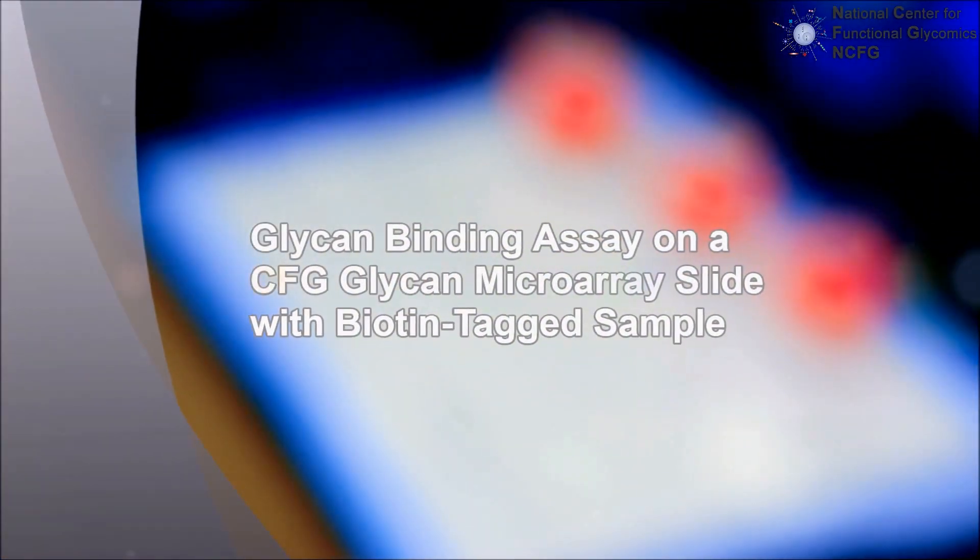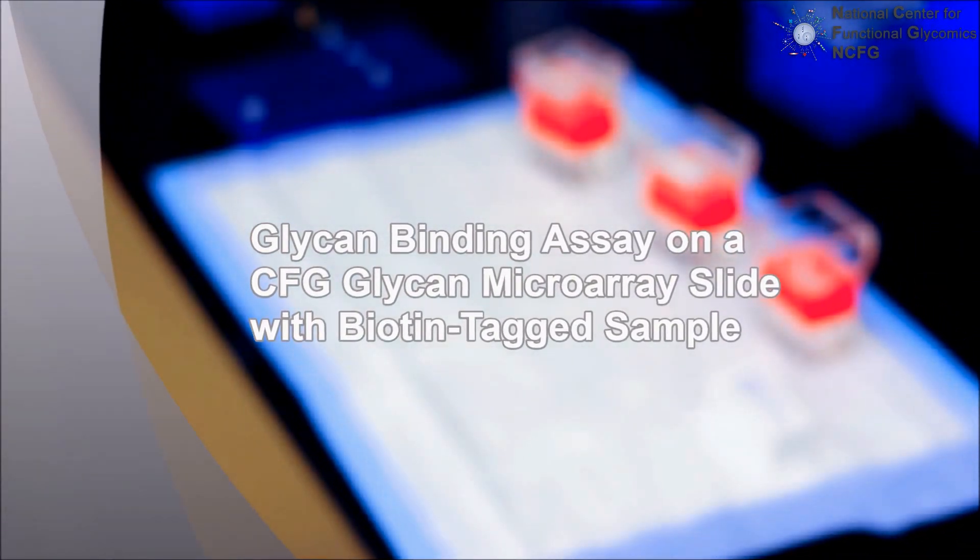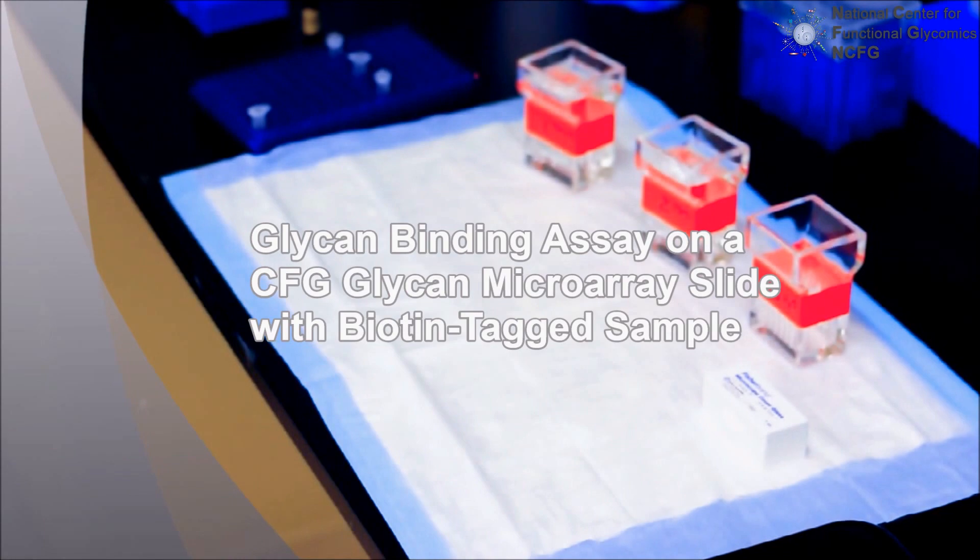The following video is a demonstration of an assay performed on a CFG glycan microarray using a biotinylated lectin and fluorescein conjugated streptavidin.